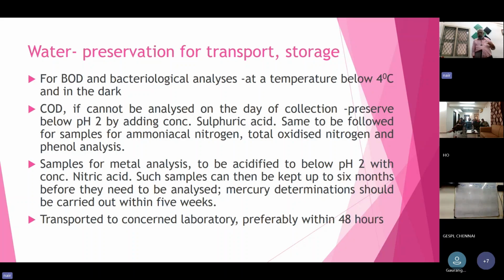How will you test the pH? You have to have litmus paper with you. Add concentrated sulfuric acid, then mix the sample, then test it using litmus paper. So while going to the sampling site, you should have litmus paper also with you.